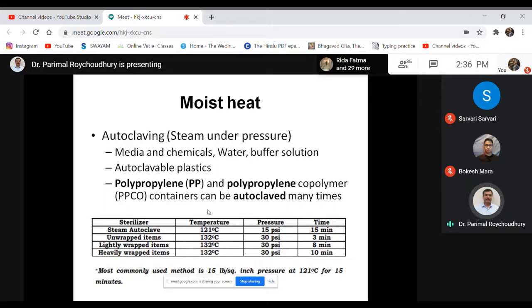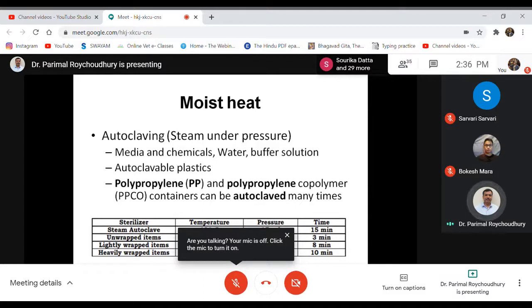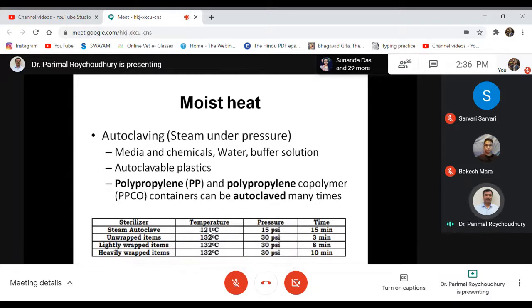And the same principle he applied, and he designed an equipment called autoclave, and the process is called autoclaving. Out of his research, what he found is that until and unless we attain the temperature 121 degrees centigrade, and maintain this temperature for 15 minutes, the resistant spore will not get killed. So autoclaving is a process, a steam under pressure, where we heat up the item in a moist environment up to 121 degrees centigrade, and we maintain that temperature for a minimum of 15 minutes.